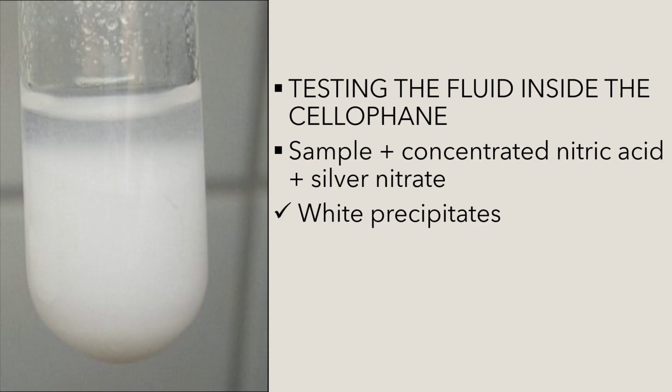We tested the fluid inside the cellophane. For the expected result, the fluid inside the cellophane will contain starch and sodium chloride.